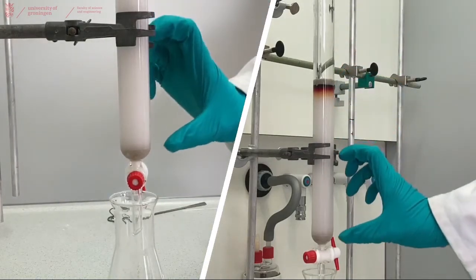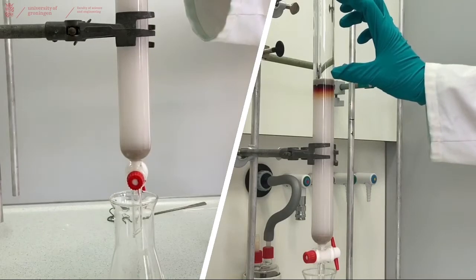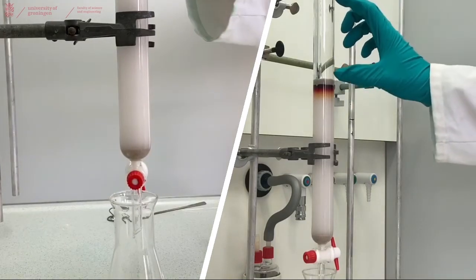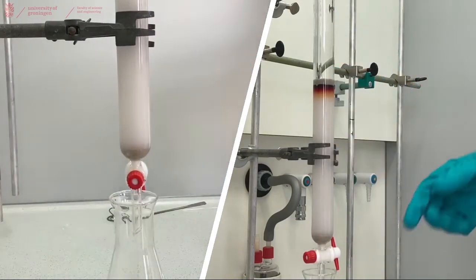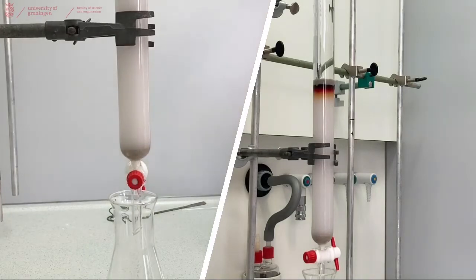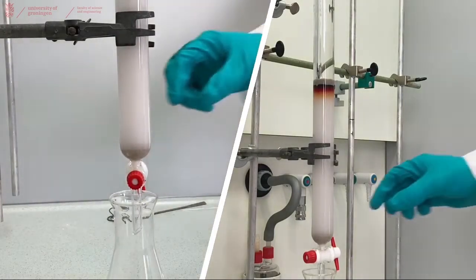After around 60% of this volume, so that is about this, which is a similar amount that was on top of our column now, is run through, we will start collecting our fractions. But now we will just push through 60% of volume.